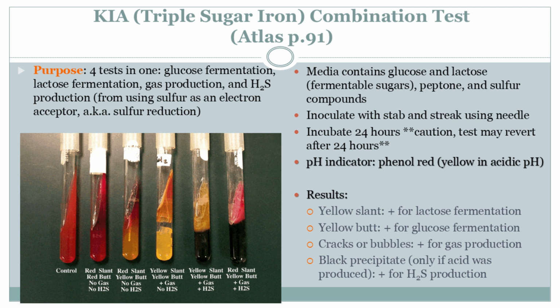So it's like a bacterial lineup. We're narrowing down the suspects. Precisely. And the beauty of it is you get so much information from just one test. It tells us all about a bacterium's metabolic capabilities, what they like to eat, what they produce as waste. It's all there.